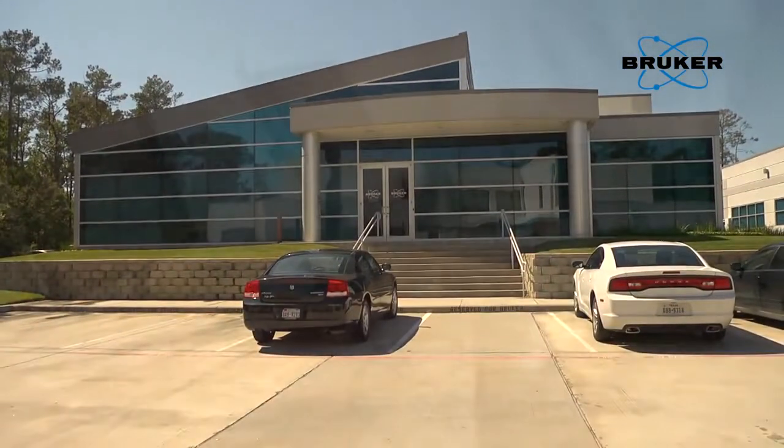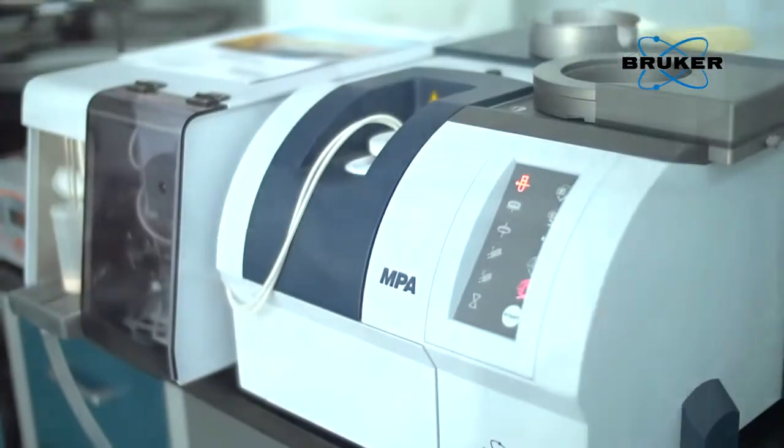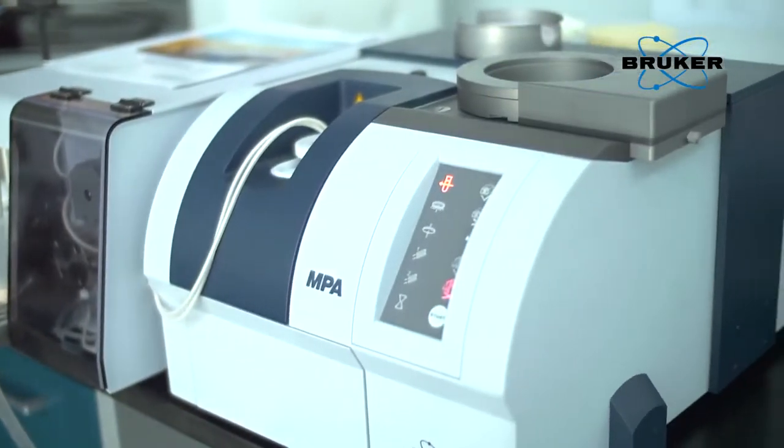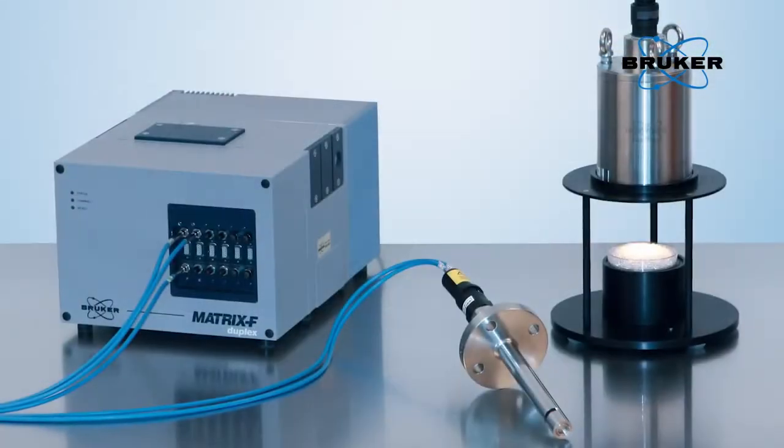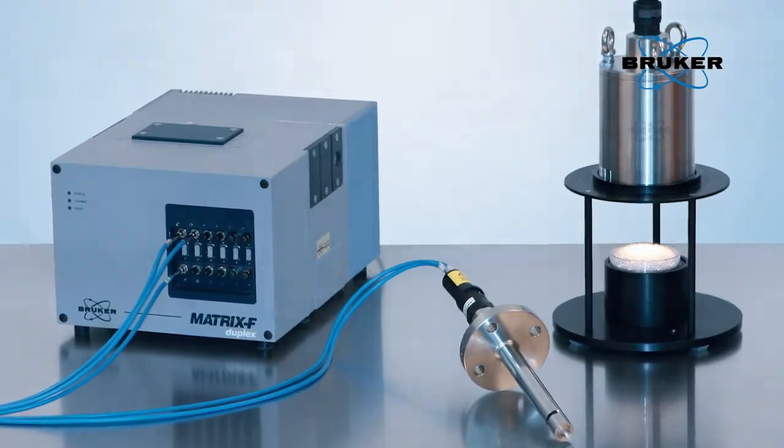Bruker's FT-NIR product line includes the Tango, the MPA, and Matrix I spectrometers for lab and at-line applications, as well as the Matrix F series for process control.